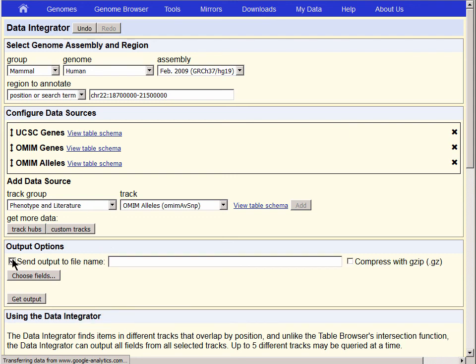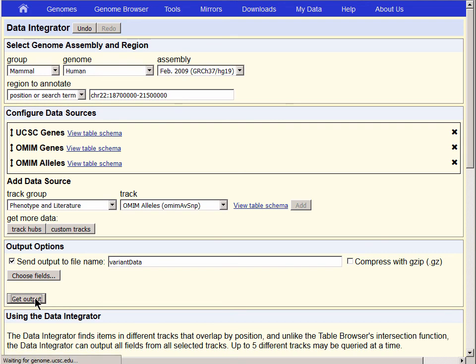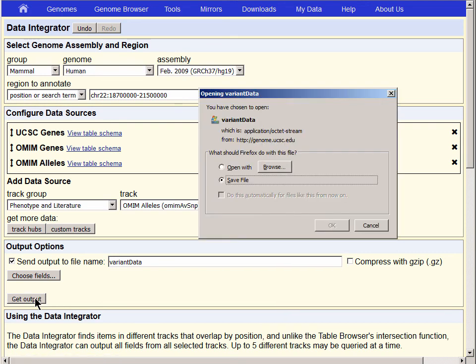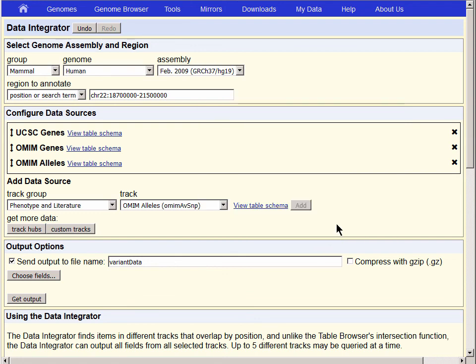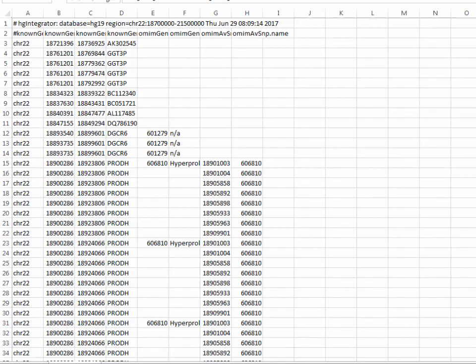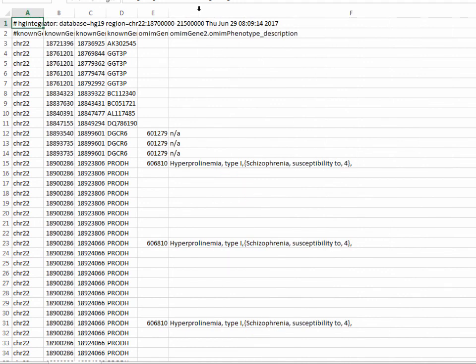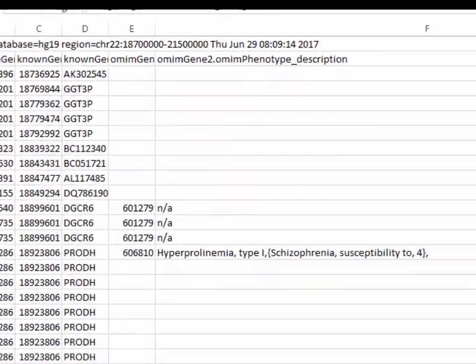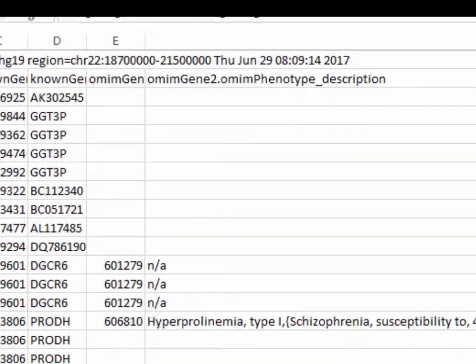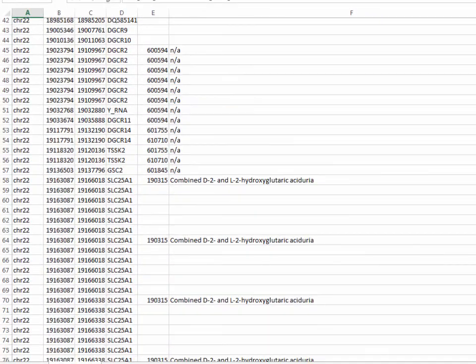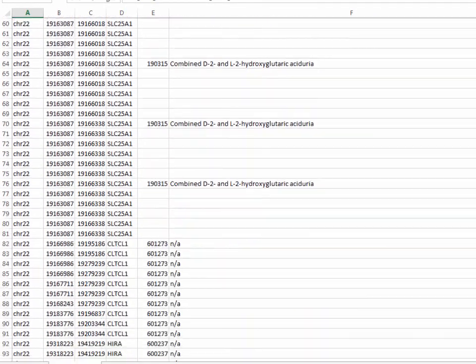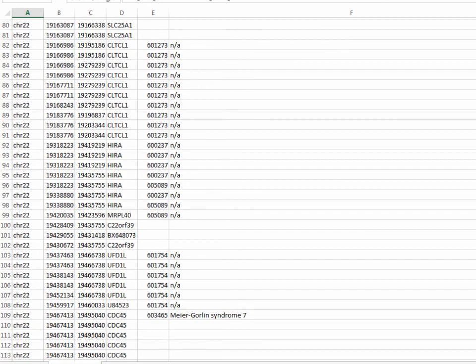We can call our data VariantData, and at Get Output, we're now asked to save the file. It will load each column into columns on the table using tabs as the delimiter, and so each of the columns from the various tables will be incorporated into the spreadsheet into a separate column. I'm going to double-click here at the top of column F to expand the OMIM Gene 2 OMIM Phenotype Description field so that you can see all of the descriptions that are reflected in the data.